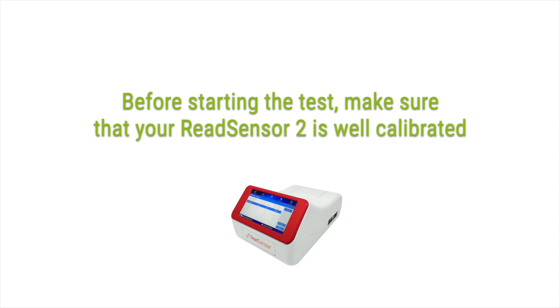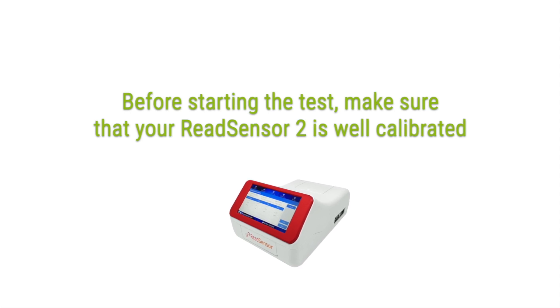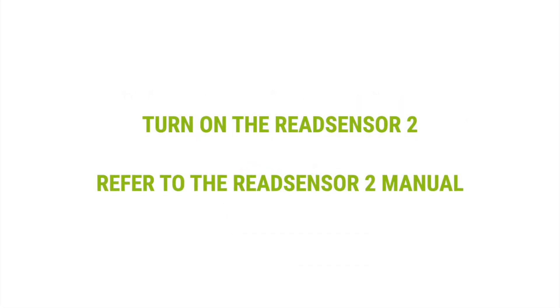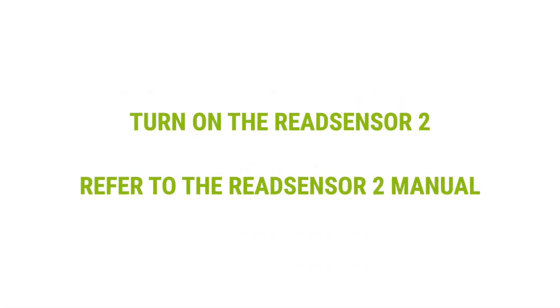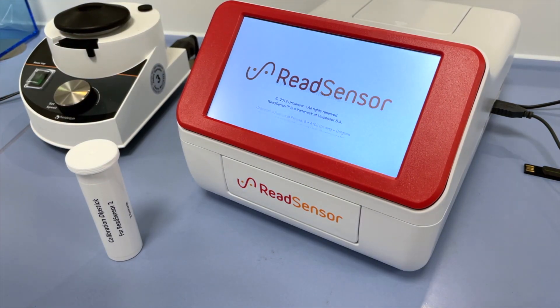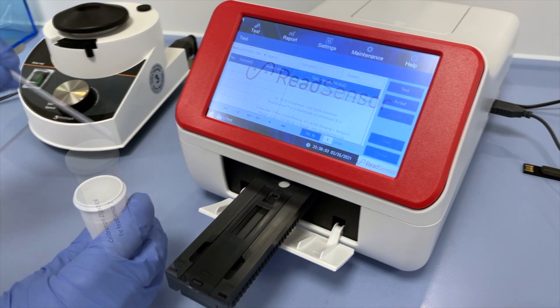Before starting the test, make sure that your ReadSensor 2 is well calibrated. Turn on the ReadSensor 2 and refer to the User Manual. Ensure that the check calibration was performed according to the ReadSensor 2 User Manual.